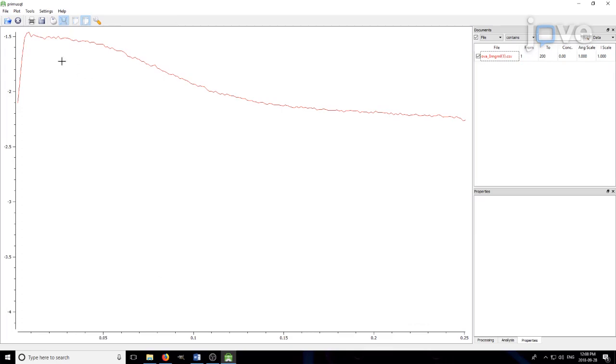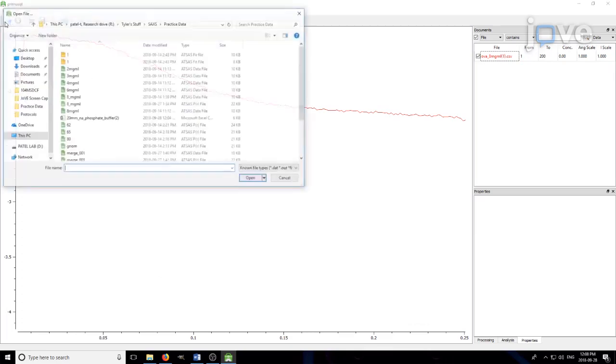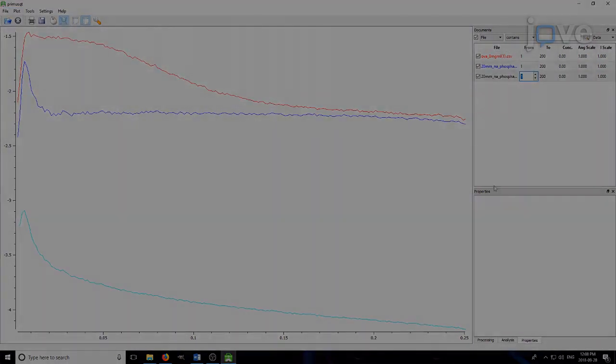Repeat this step for the buffer-only data, inserting this data into a second Tools menu.